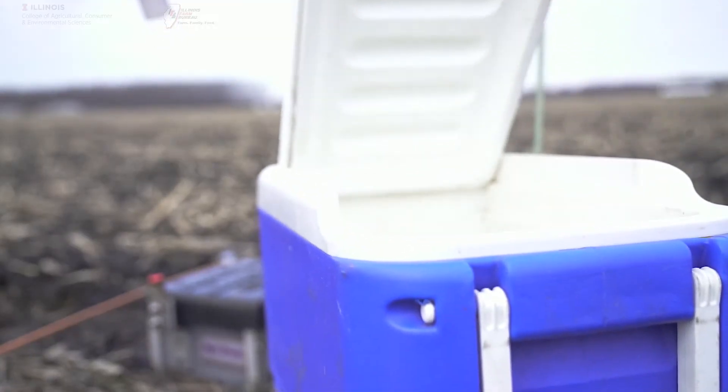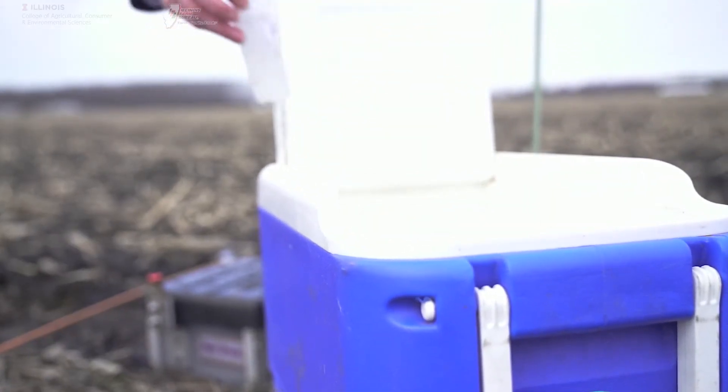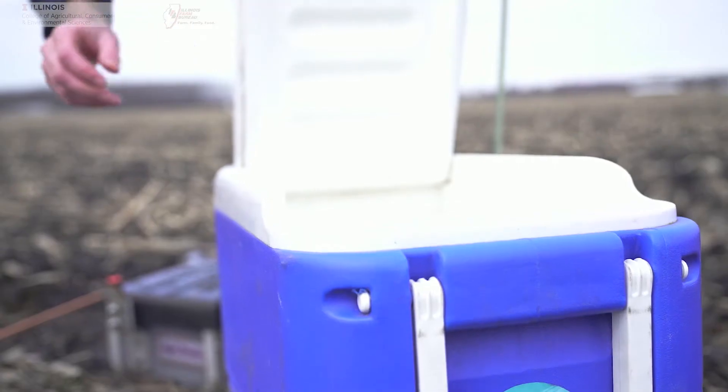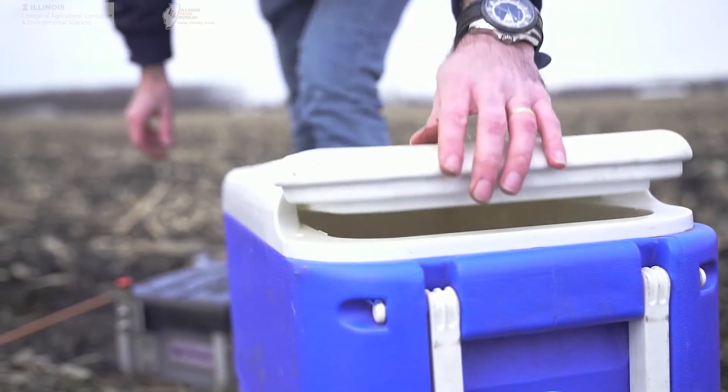Put the sample on ice for transport and keep it frozen until it can be thawed for analysis at the laboratory. It's essential to keep the samples very cold so that bacteria naturally present in the water don't change the forms of nitrogen in the water before it's analyzed.